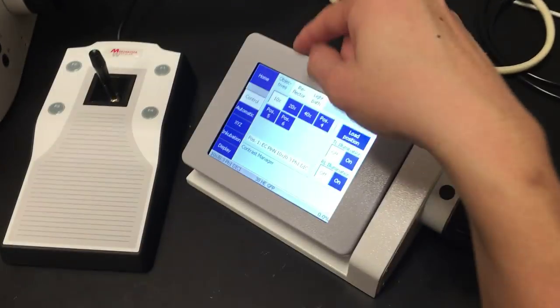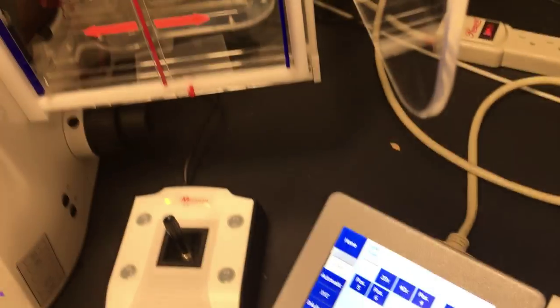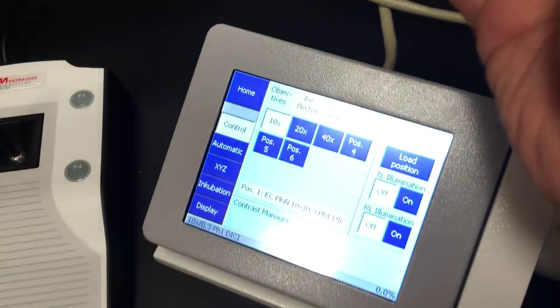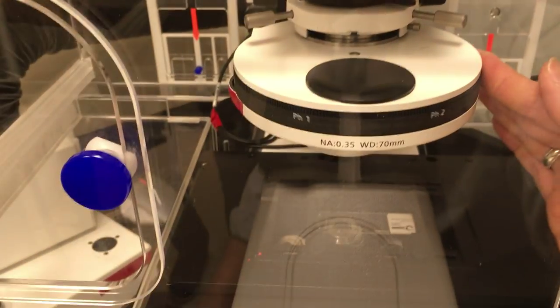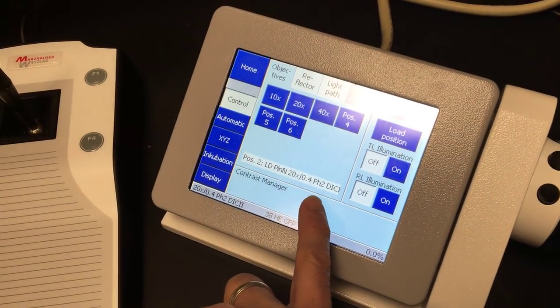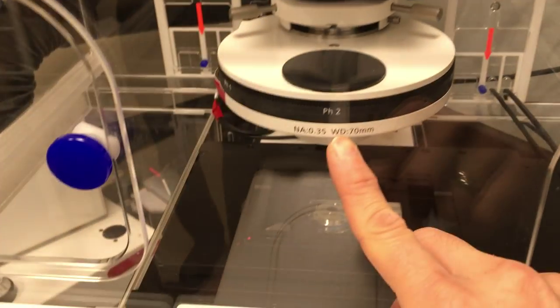The important thing to remember right now is the 10x uses phase 1—you're going to turn the ring to phase 1 if you want to do phase. The 20x uses phase 2, so you're going to turn this to phase 2 when you're doing 20x. And the 40x also uses phase 2, so you're going to turn to phase 2.